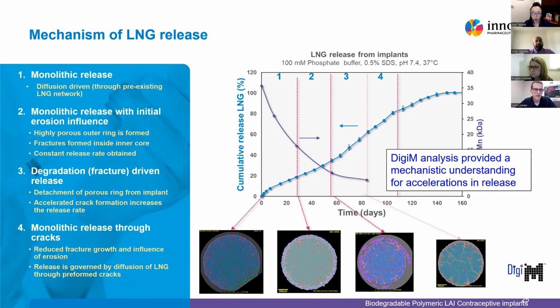This is something that, in the world of drug release, is going to give us more dissolution media penetration and ultimately an acceleration in drug release. So all in all, this time-based imaging, collecting different implants from different release testing times, allowed us to understand mechanistically the accelerations in drug release over time for this implant.